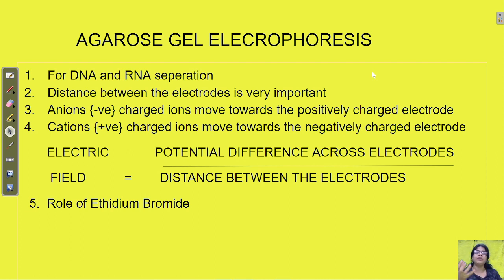DNA nuclease would degrade your DNA, but we want it in a native form. To reduce the activity of that DNA nuclease, you add EDTA to the buffer, which reduces the magnesium ions responsible for the nuclease to function. That is how EDTA is important for the buffer.